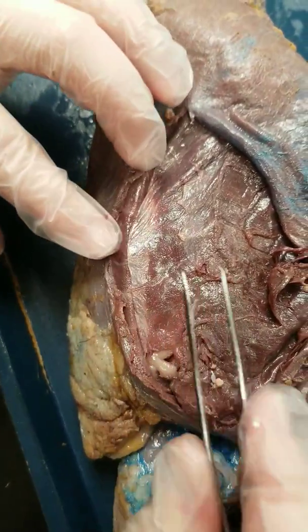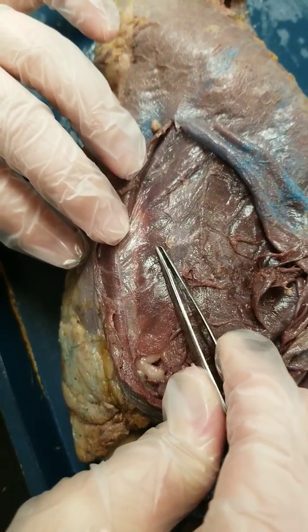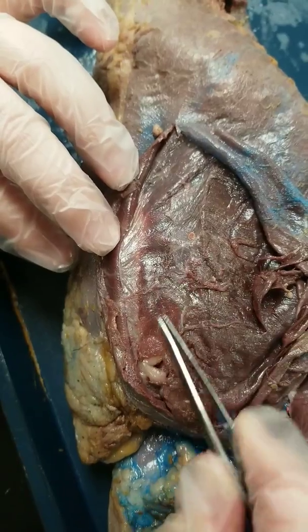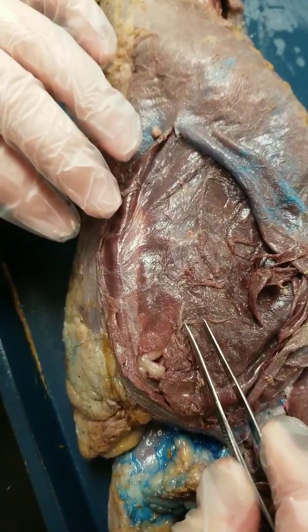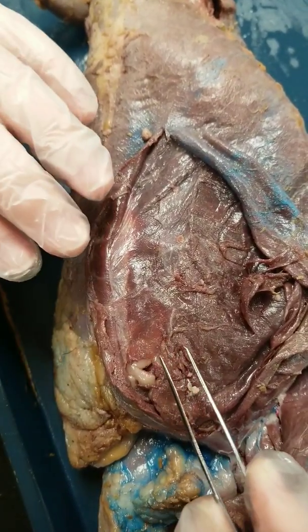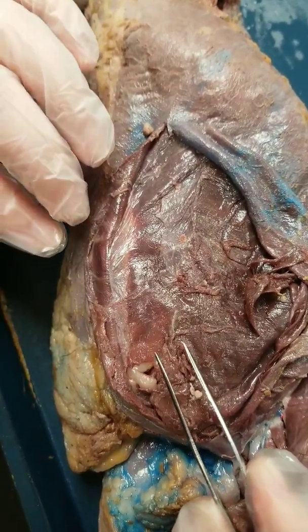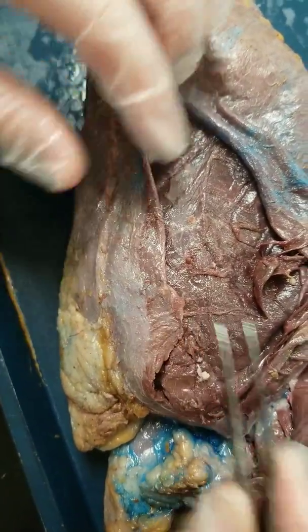The last muscle is the transverse abdominis muscle. You can see it flat against the abdomen, against the intestine. Leave it flat. If you try to peel that up, you'll end up seeing intestine and internal organs, and we're not ready to do that yet. So just leave the transverse flat against the abdomen.